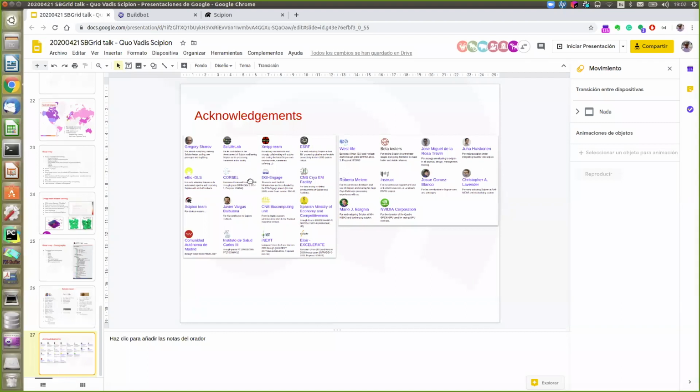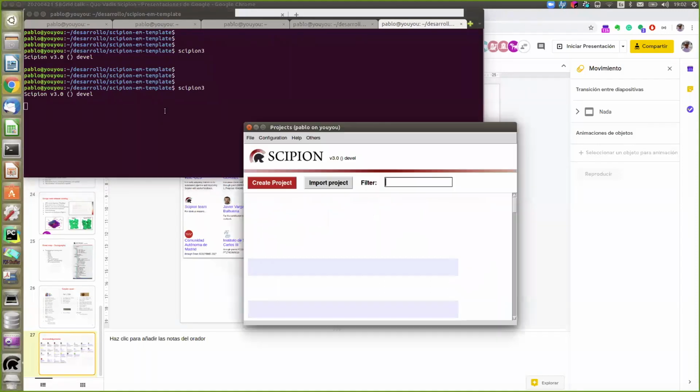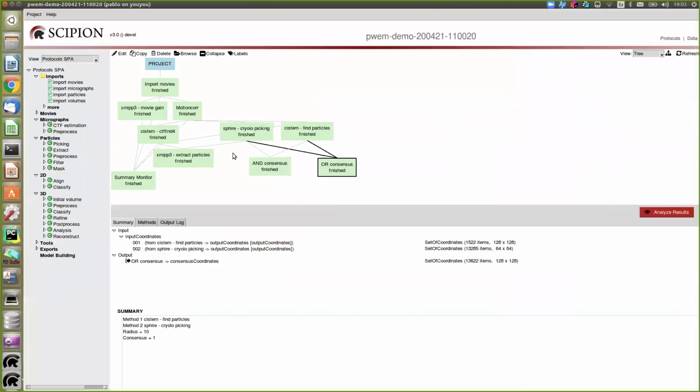Yeah, so I mentioned, maybe I can show. Are you asking for the picking? Well, there are actually three consensus methods. One is for CTF, the other is for picking, and the other is for classes. I'm more asking as a general approach. Is this more like ensemble-based learning, or is this more like combining different statistical estimates? It's basically combining estimates.